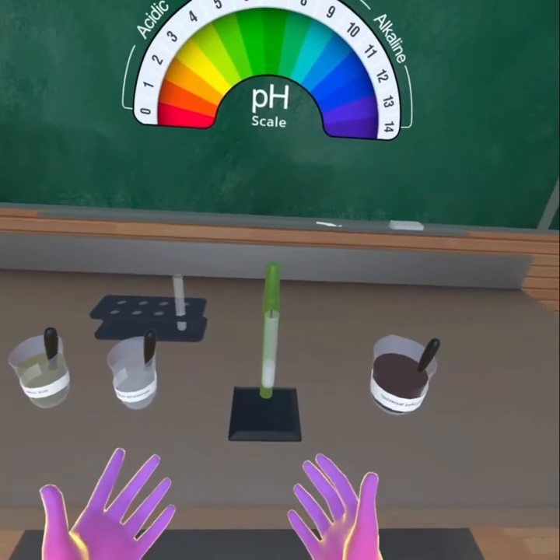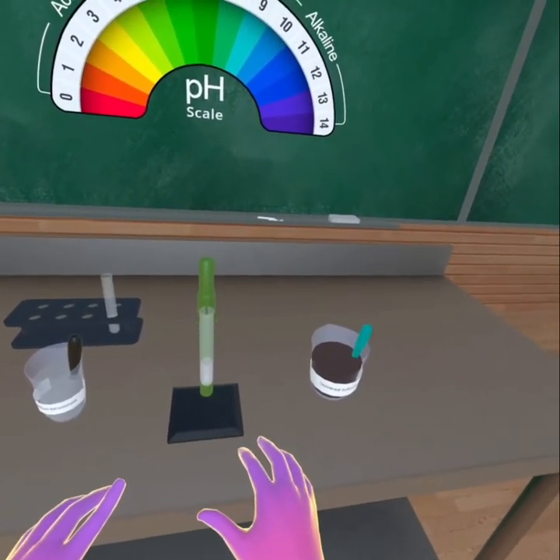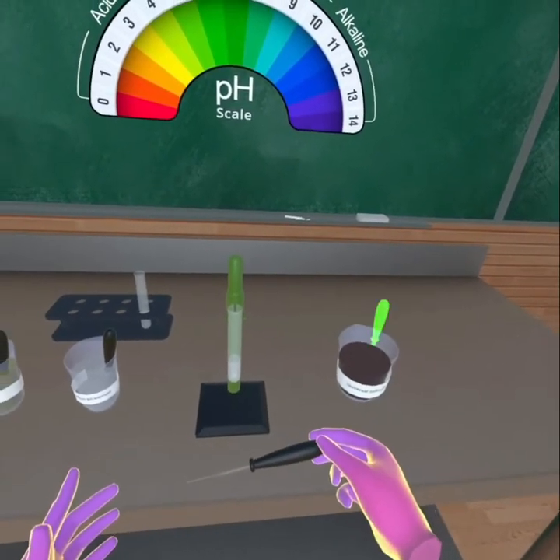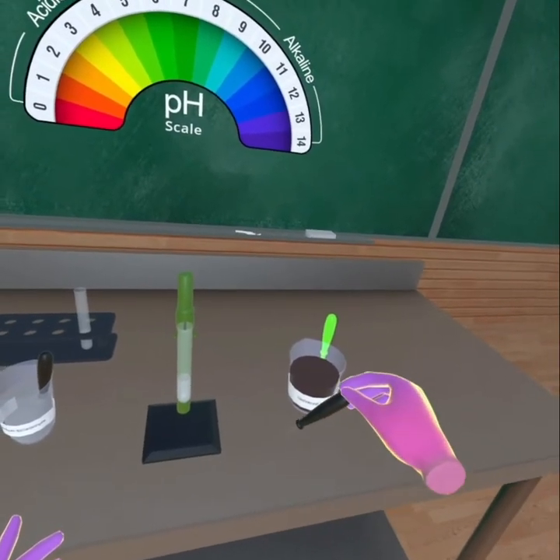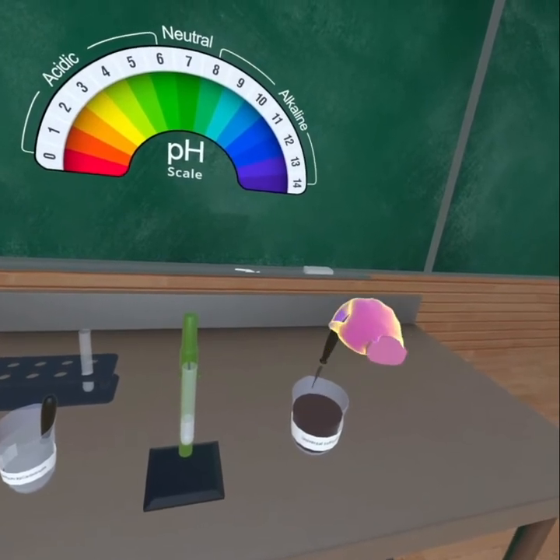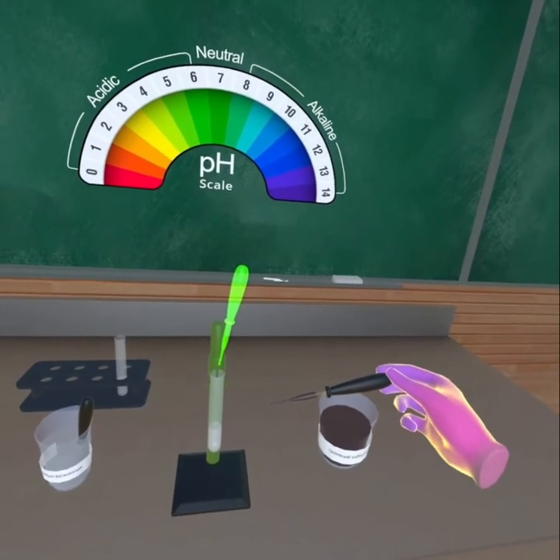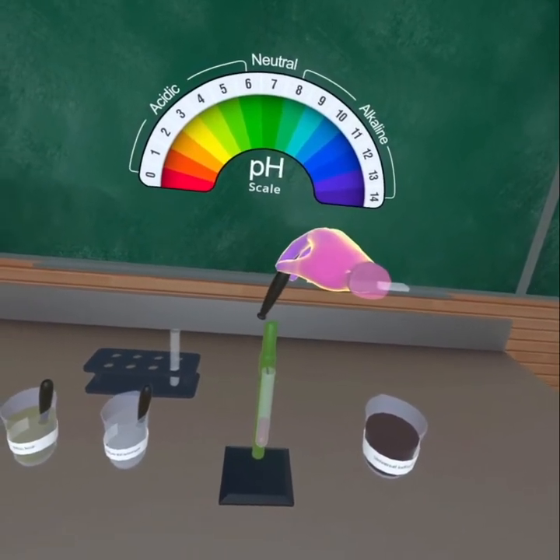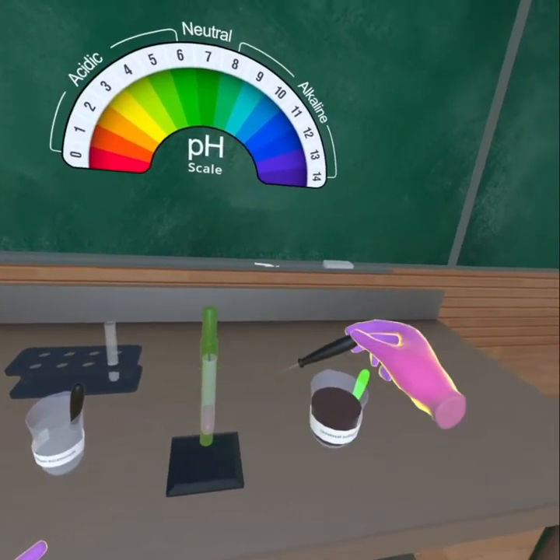Now, grab the dropper which is inside the universal indicator solution jar. Nice work! Place the dropper inside the jar, with its nozzle kept in the universal indicator solution. Now press the bulb of the dropper. Well done! Pour the universal indicator solution in the test tube. Great work! Place the dropper back in the universal indicator solution jar.